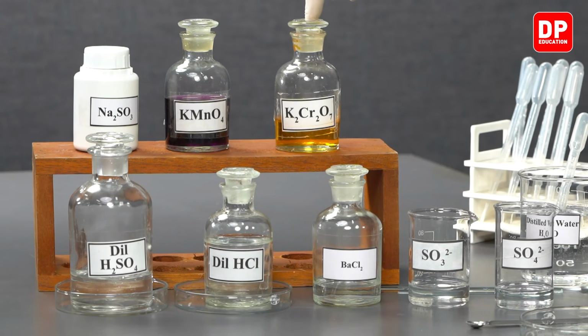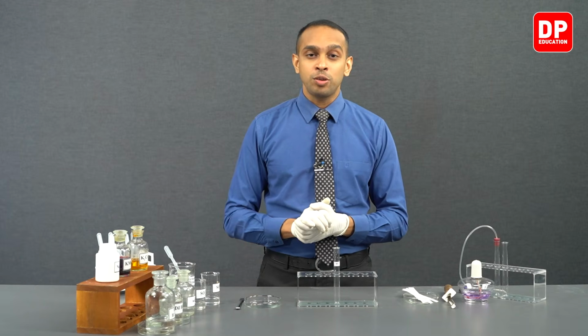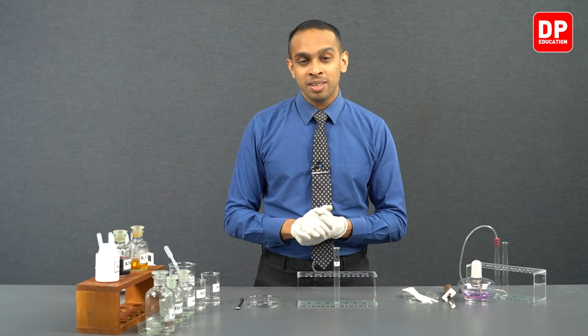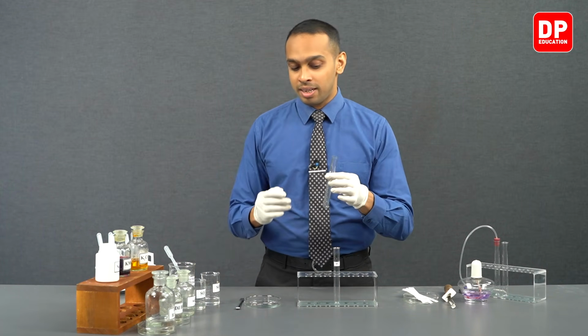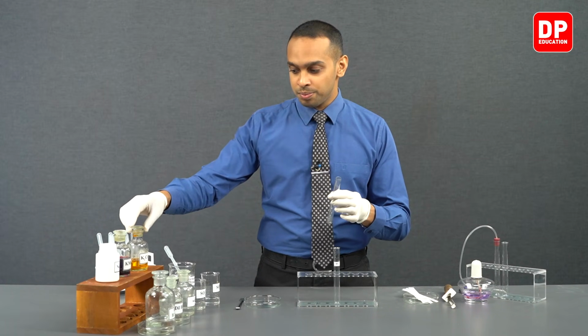So the potassium dichromate that we have over here is just an aqueous solution of K2Cr2O7, or potassium dichromate. You can observe that it's an orange color solution. We have to first acidify our potassium dichromate solution. So let's take a test tube and acidify our potassium dichromate solution.